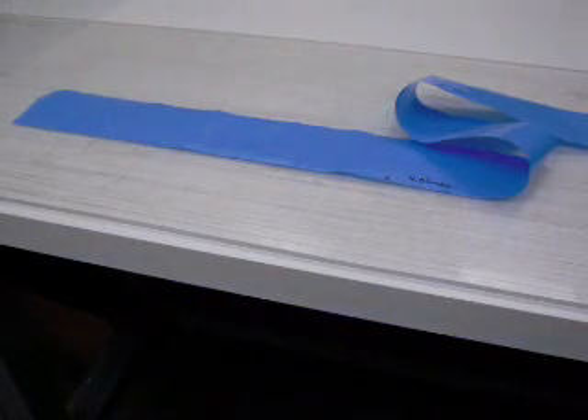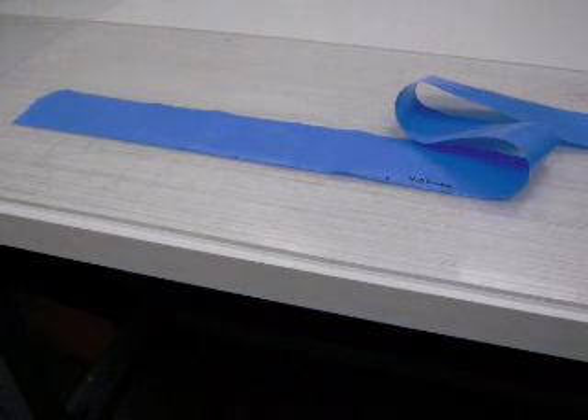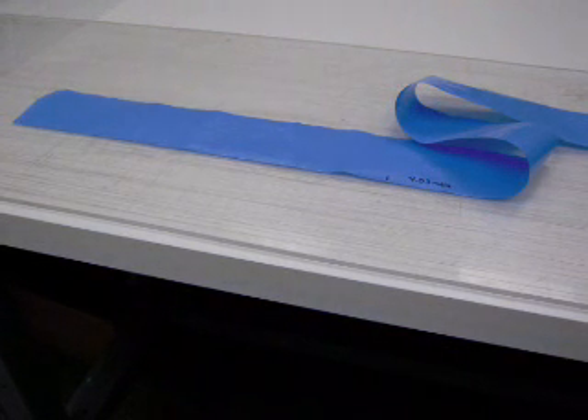Film samples are cut to approximately 125 mm or 5 inches wide. Film is defined as sheeting having a thickness of not greater than 0.25 mm or 10 mil, as indicated by ASTM Standard D6988.